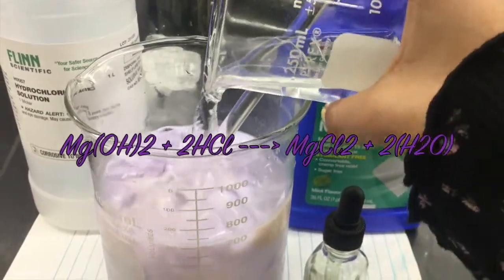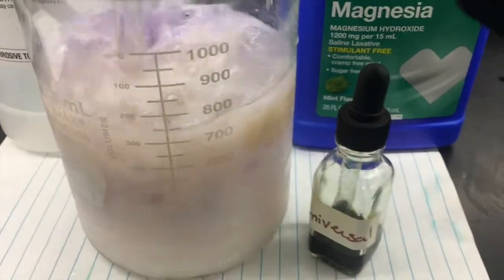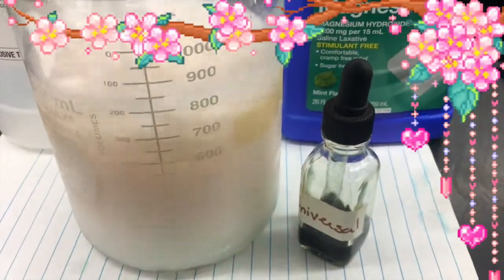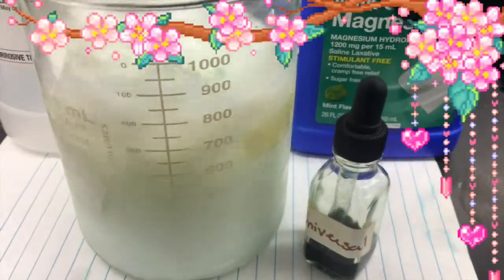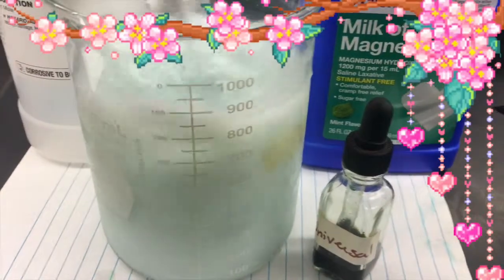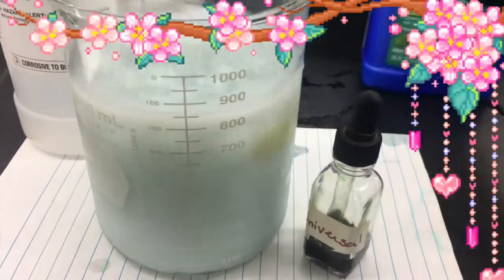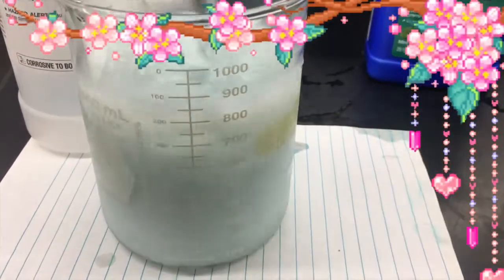Hydrochloric acid causes more Mg(OH)2 from the suspension to gradually dissolve. As more of the Mg(OH)2 goes into the solution, the acid is neutralized, and eventually the solution becomes basic again from the excess Mg(OH)2 that is present. The addition of universal indicator allows this process to be observed.